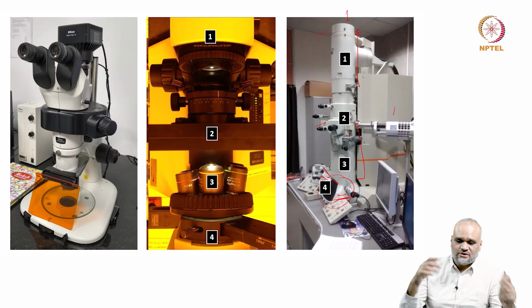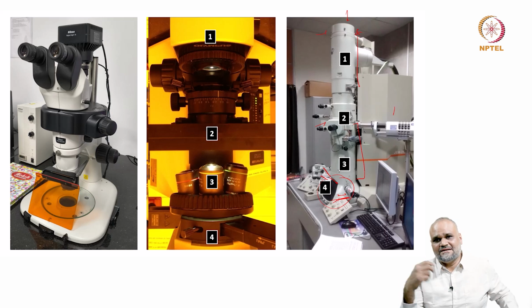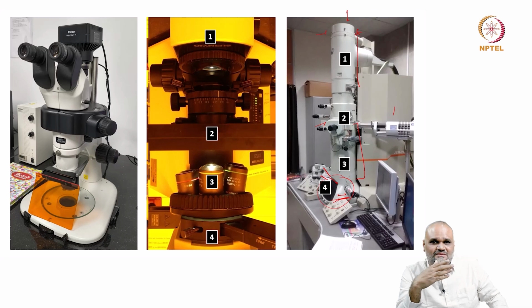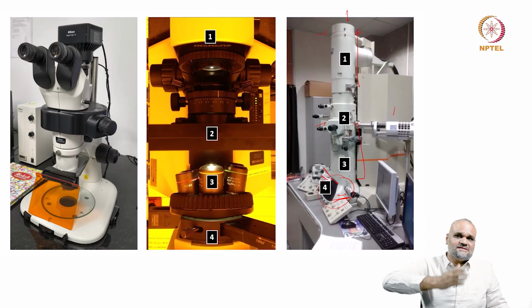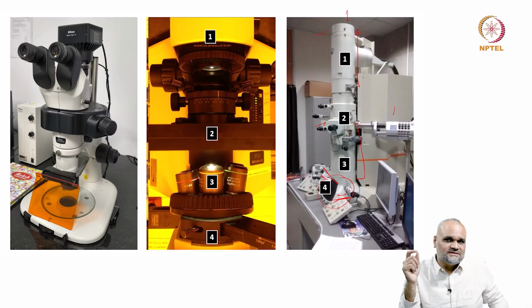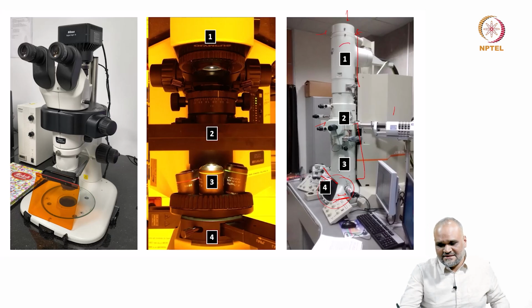And if you bring your hand close to the screen, it so happens that the hairs on your hand can stand and stick to the surface of a cathode ray tube. Now, why does this happen? You have the charged particles that are coming out. As an example, even the electrons can hit on the surface of the cathode ray tube, but these are very low energy electrons.